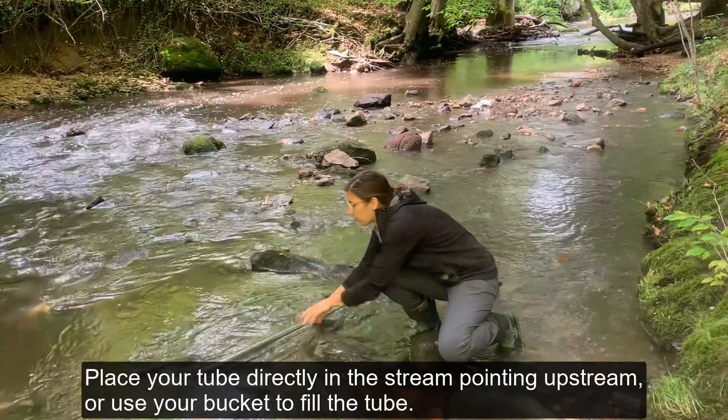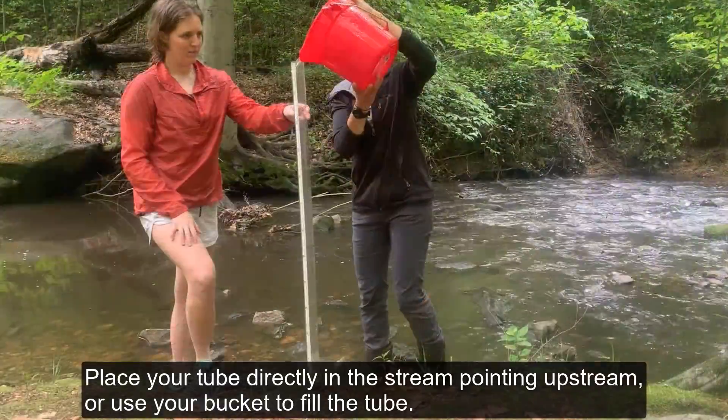Place your tube directly in the stream, pointing upstream to fill it, or use your bucket to fill your tube.